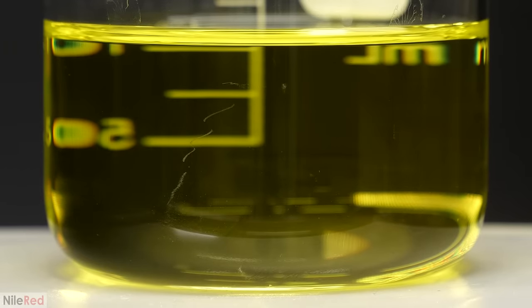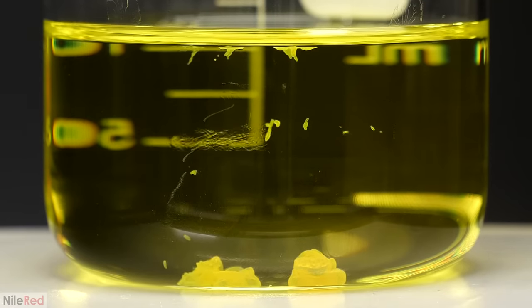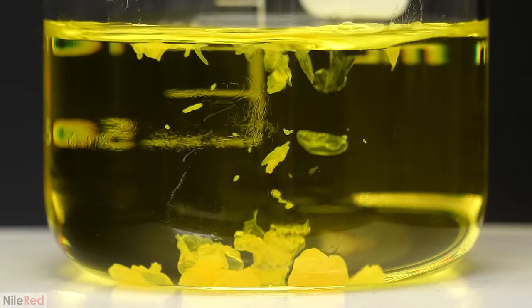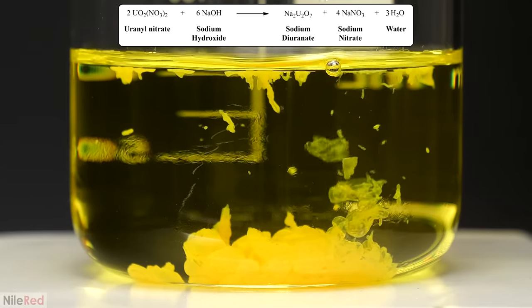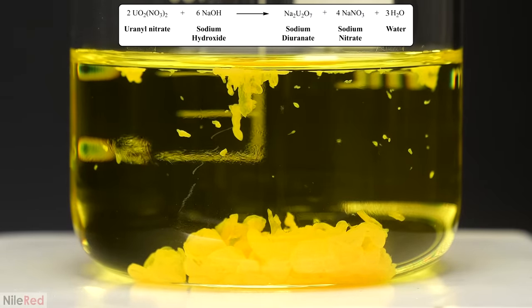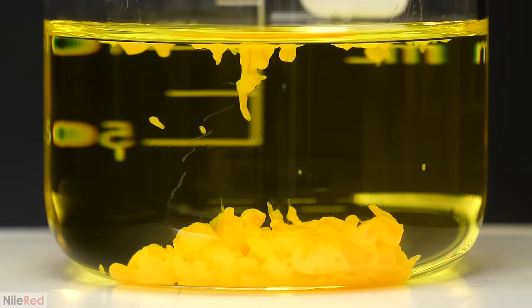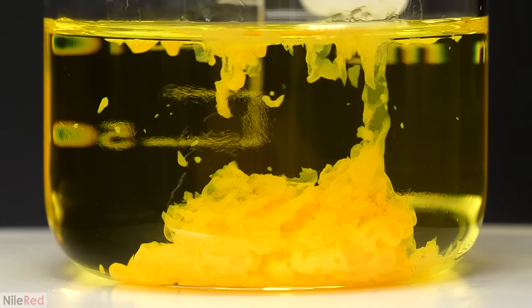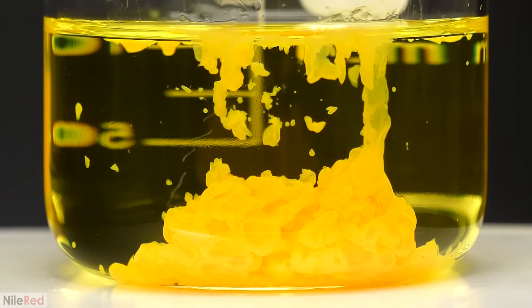When I felt it was good, I took it out of the fridge and slowly started adding it to the uranyl nitrate. Almost immediately, it started forming these weird solid doughnut-looking things, and this was all sodium diuranate. The reason this happened was that unlike the uranyl nitrate and the sodium hydroxide, the sodium diuranate is practically insoluble in water, so the moment it formed it separated out. I had to keep adding the sodium hydroxide until it stopped making the diuranate. To know when it was done I had to keep testing the pH using some cheap pH papers, and I kept adding the hydroxide until it turned blue, which told me that the pH was about 10.